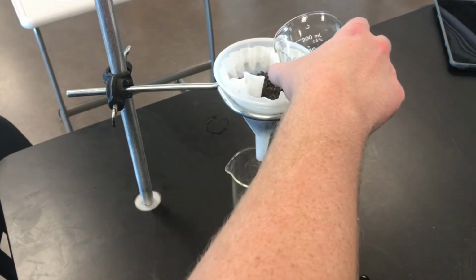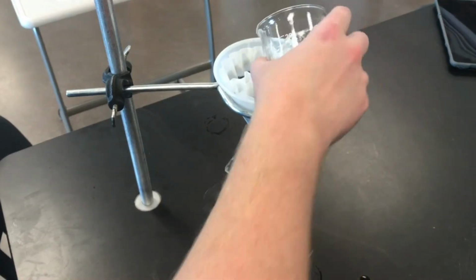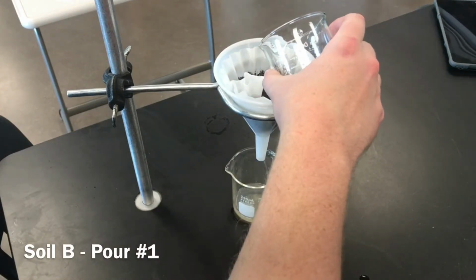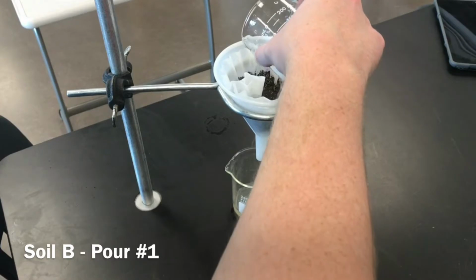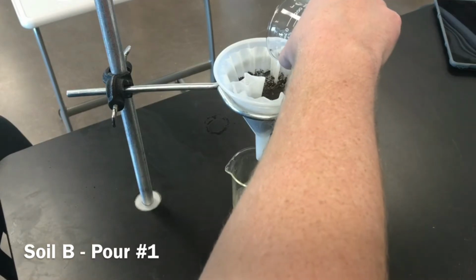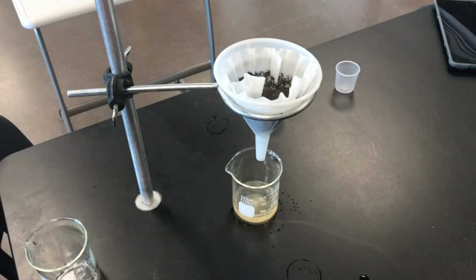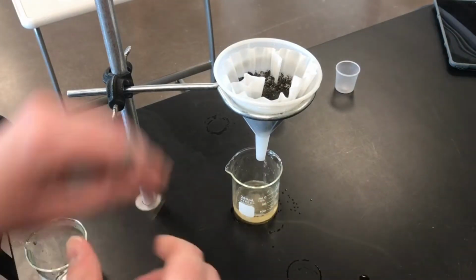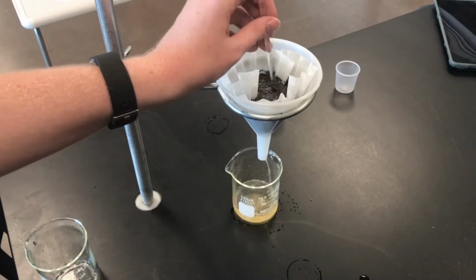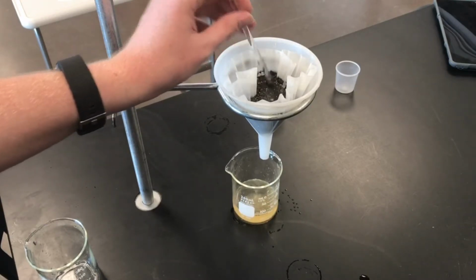Make sure not to dump it all out at once. Just pour it through nice and slow. Actually, the slower that you pour it, the faster this is going to go. So if you dump it all out at once, you're going to be waiting quite a long time here for it to come out. Looks like mine's coming out just a little slow. So again, you can take a stir rod, as long as you don't break anything in the coffee filter, should be totally fine. Mix around my solution a little bit.